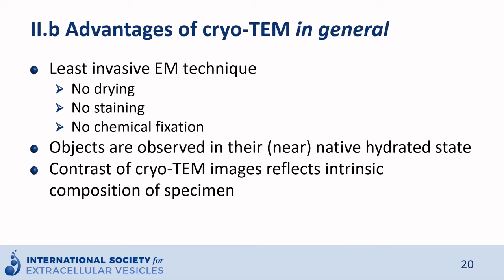What are the advantages of cryo-TEM in general? Cryo-TEM is the least invasive EM technique. There is no drying, no staining, no chemical fixation. Objects are observed in their near native hydrated state, and the contrast of cryo-TEM images reflects the intrinsic composition of the specimen.